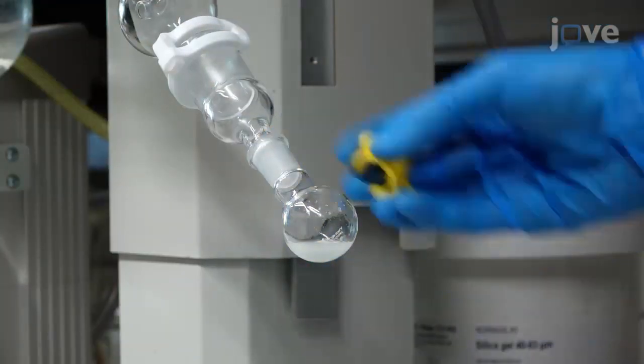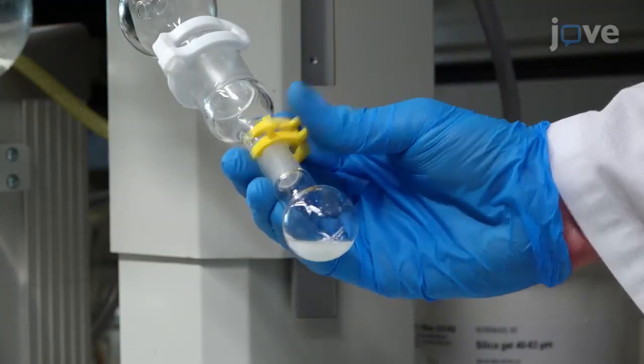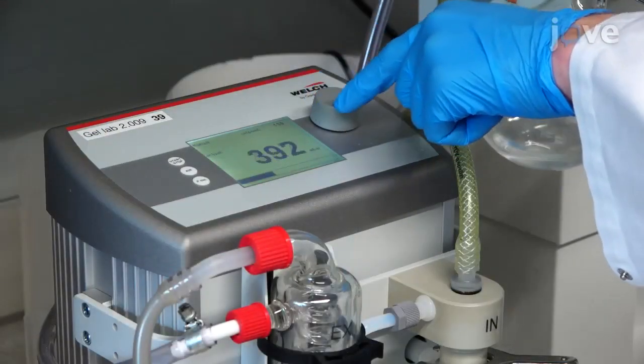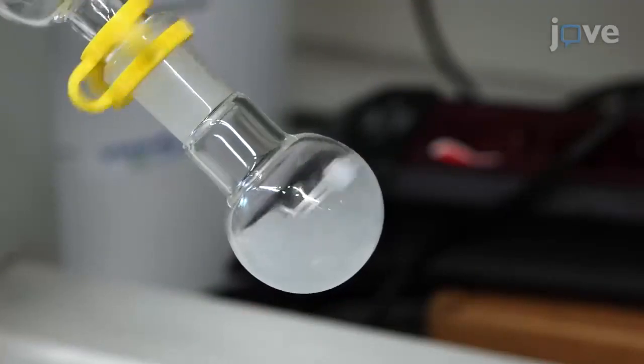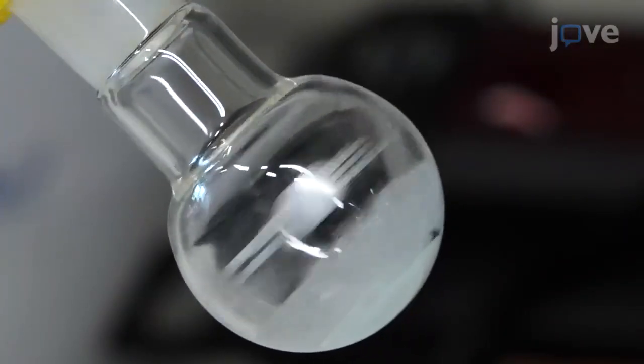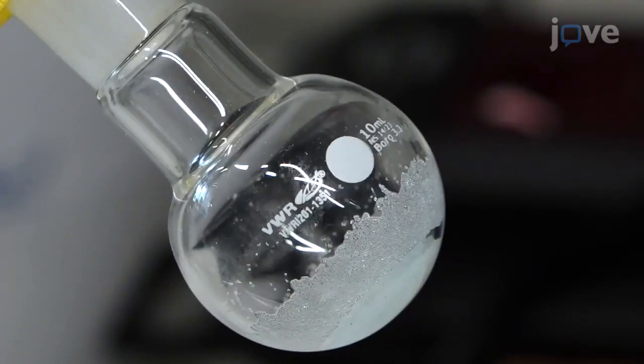Connect the flask to a rotary evaporator. Adjust the speed to 150 rpm and regulate the pressure to minus 20,000 pascals for approximately four minutes until the liquid is evaporated at room temperature.